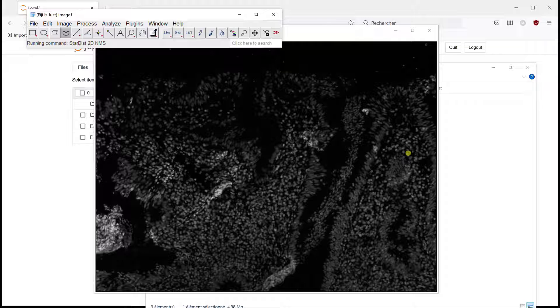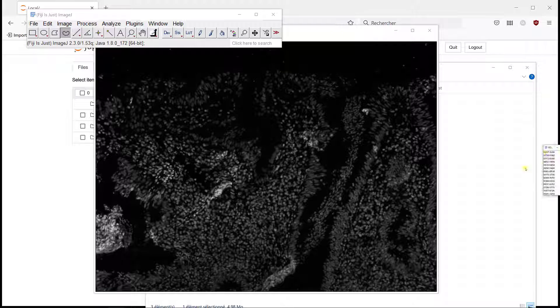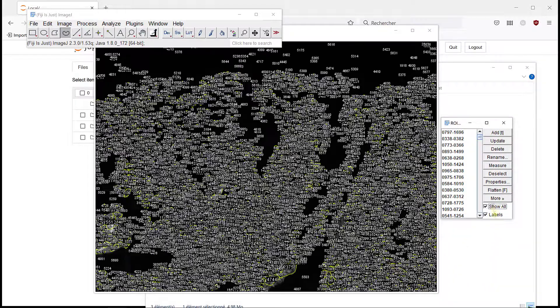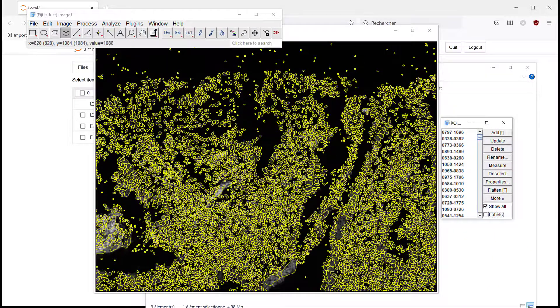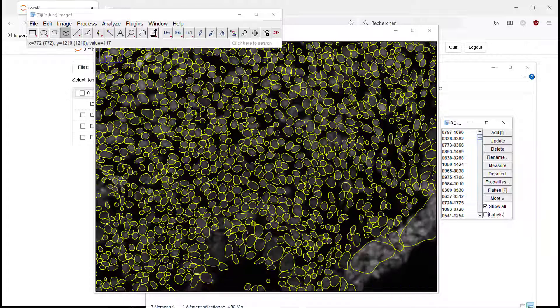And when I do that, we can extract the segmentation, segmented nuclei. And since the ROI manager is there, you can see this, we can look at the results.